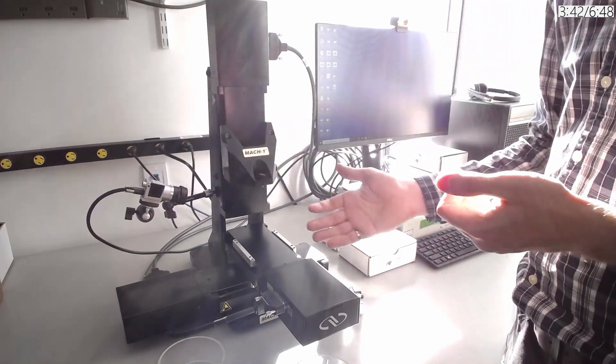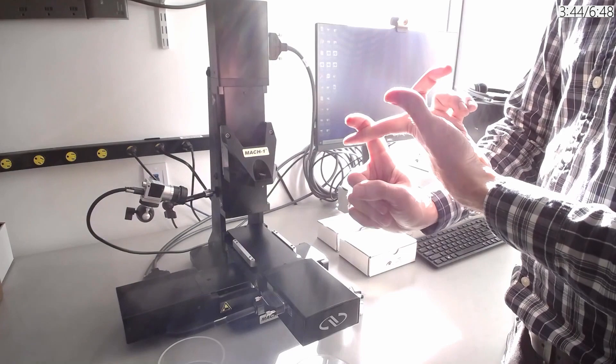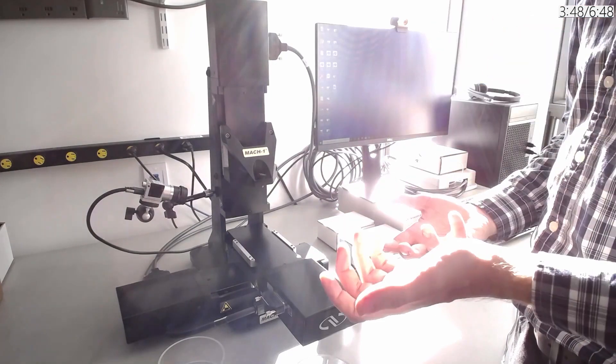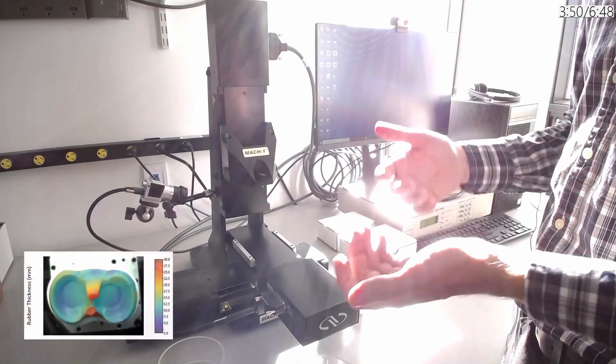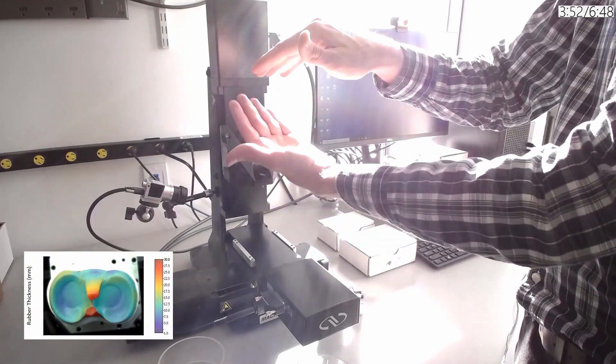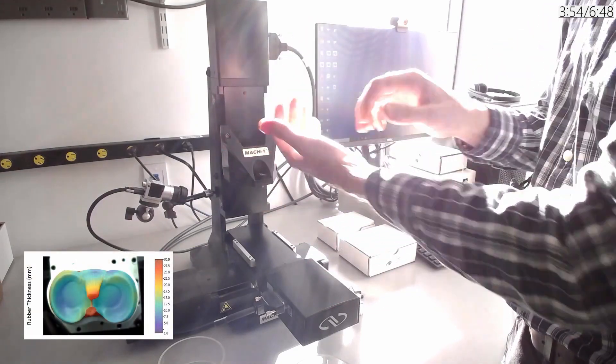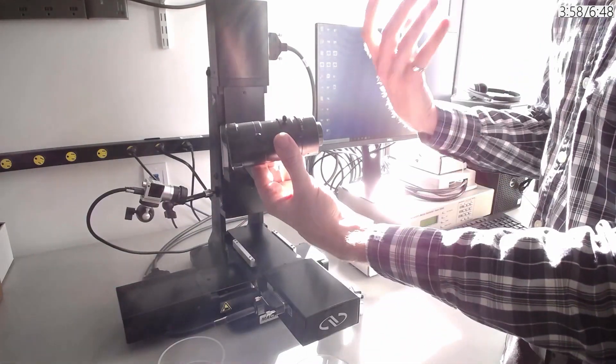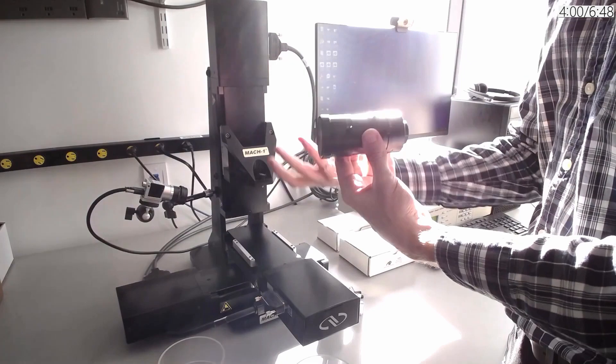The second reason to have a camera is so that you can sync the frame data to the mechanical data and perform analysis such as Poisson's ratio or digital image correlation by tracking certain points on the surface of the sample. We also have different lenses depending on how small your sample is or if you need zoom.